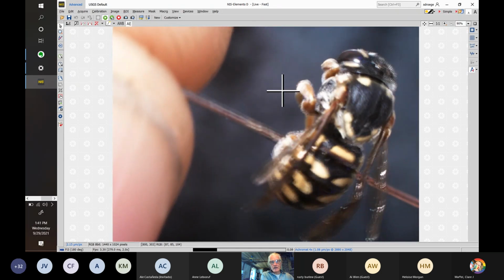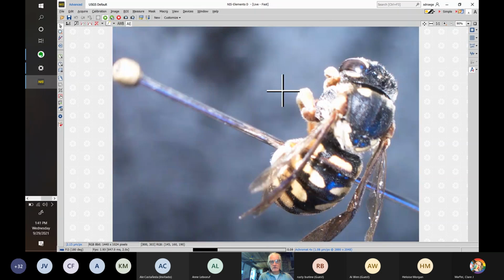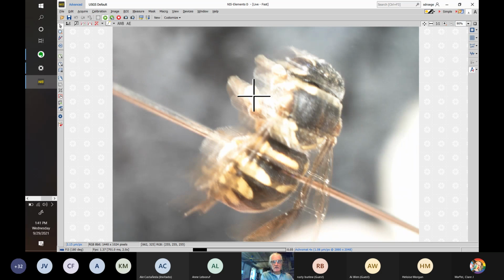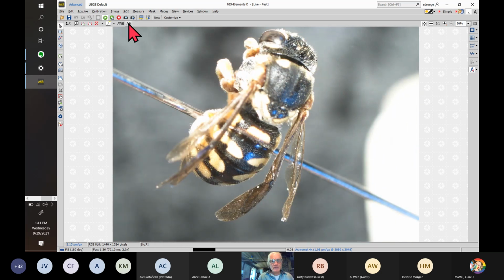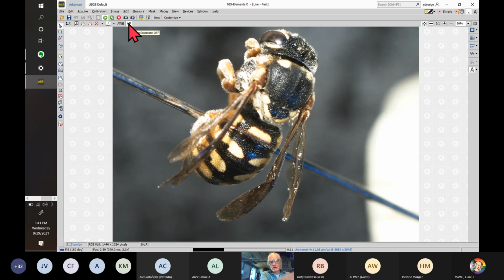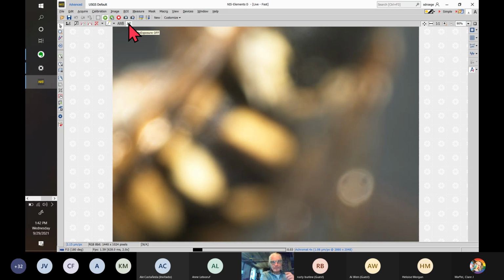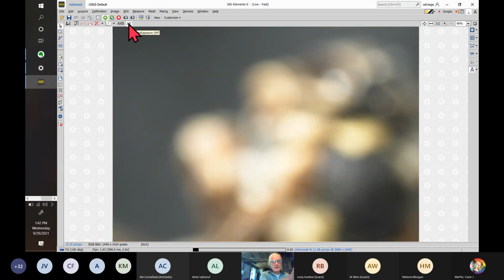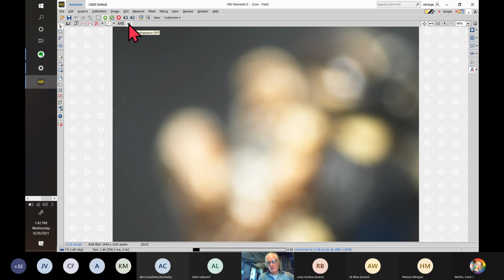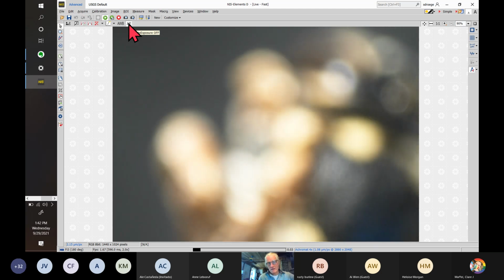And I should also point out that almost always another feature that isn't really mentioned here, but is I think useful, if I can get the white balance to be a little bit better behaved, move that over here, is that the tegula, I believe, is always D-shaped. So if we zoom in on that, let's do that here. You'll see it's large and not oval. And that maybe should be in that memorization chart. I'm not sure, but maybe it's not 100% of the time, but someone might advise on that.